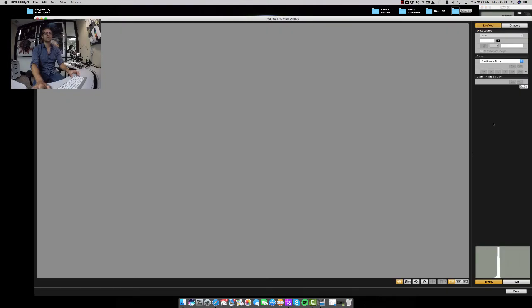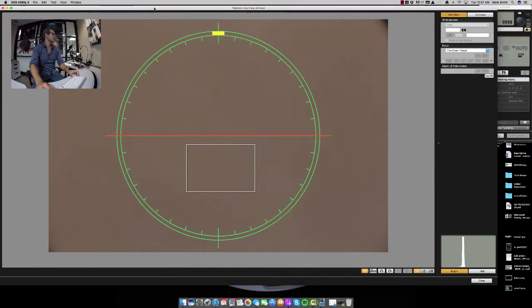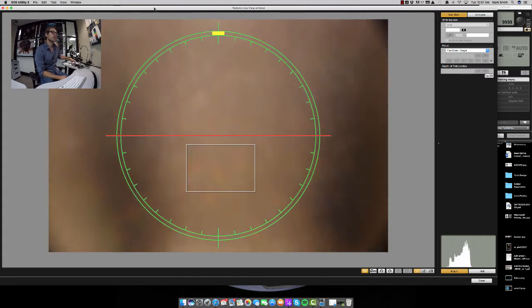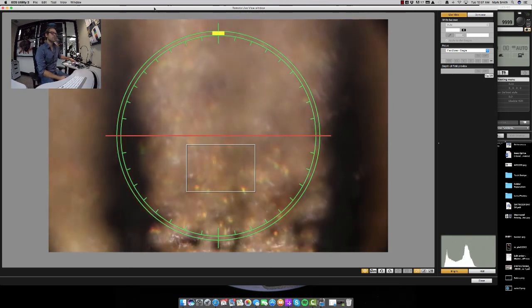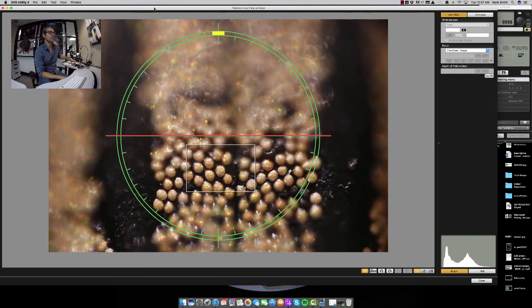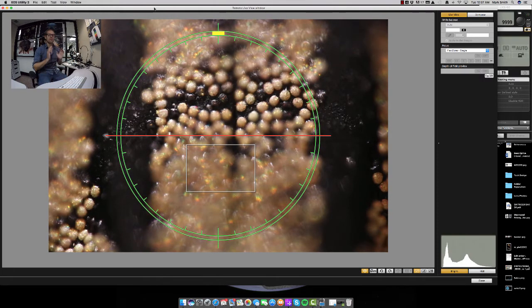The next thing we're going to do is open up our live view shoot. We're going to move our camera back into the position where it was before, and we're going to start to slide the stage forward so we can bring the specimen into the field of view of this objective. We're just going to keep pulling it forward until we see a section of the abdomen. So if you remember, for the 10x objective we ended up taking 135 steps, and that was because we were looking further down the body of the specimen, closer to the thorax.